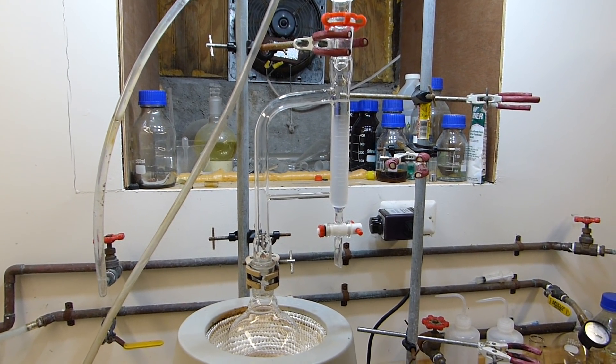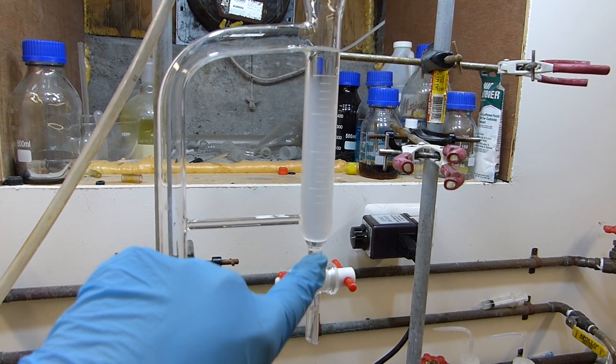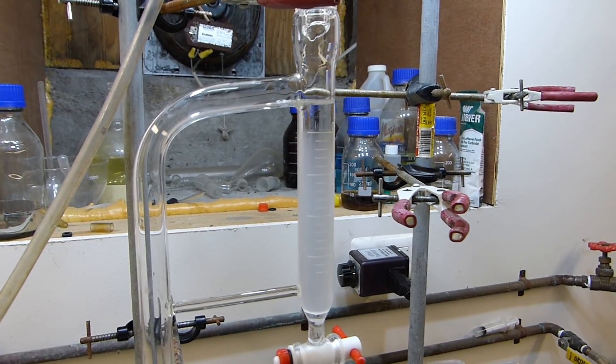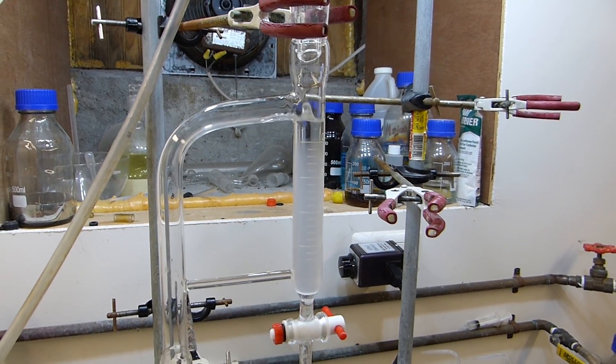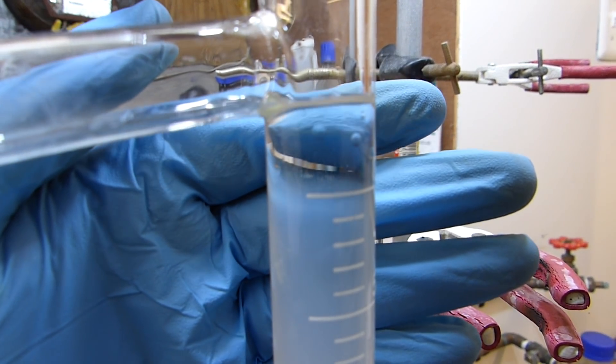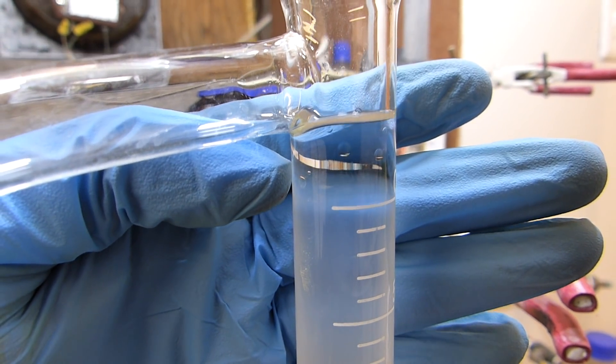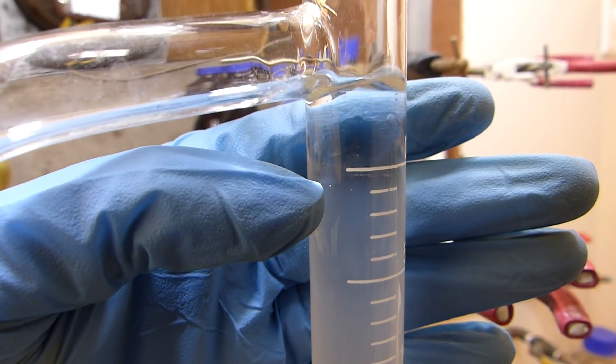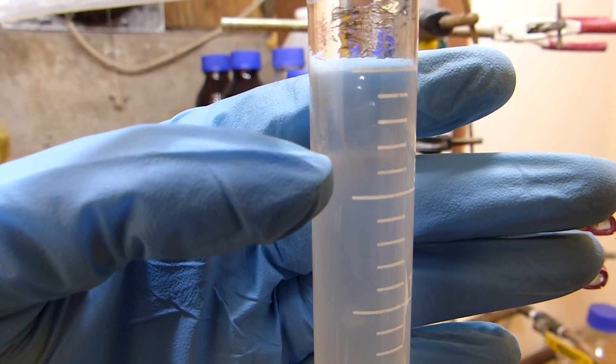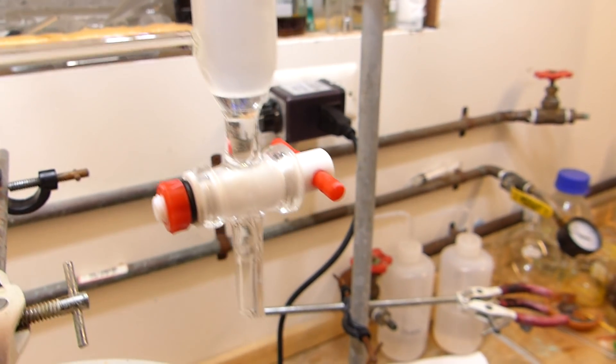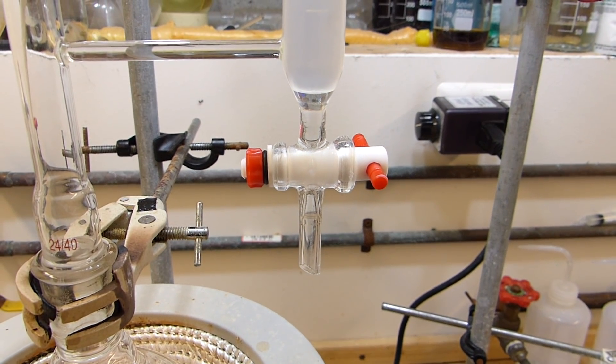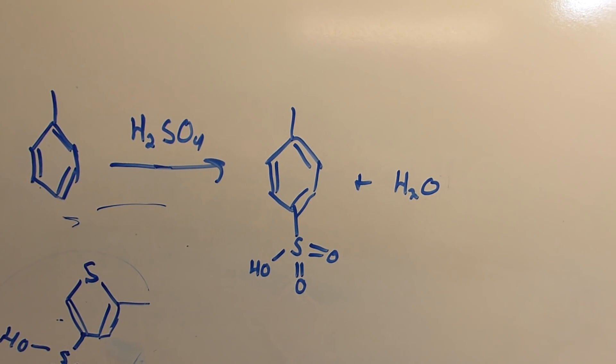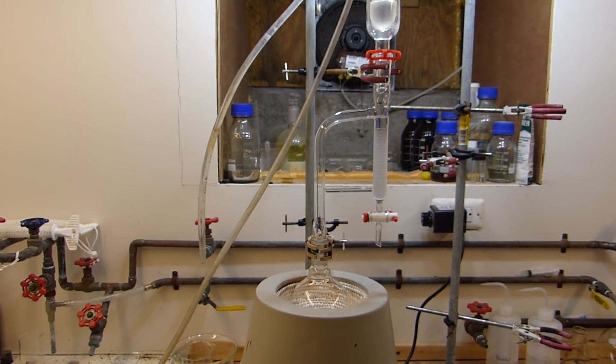I've been refluxing for about 45 minutes now and you can see that some water has indeed collected in the bottom of the Dean-Stark trap which means that we are progressing quite well. It's still a biphasic layer down there which means there's still an aqueous layer, meaning we haven't trapped all the water in the Dean-Stark trap and there's still a ways to go on the reaction. If I can get the camera to focus up close you can see that every time some drops land in the Dean-Stark trap from the condenser, a small bead of water or two will drift their way down to the bottom. That's the water that's collecting in the Dean-Stark trap that we're removing from this side of the equation, thus driving it this way to form our product.